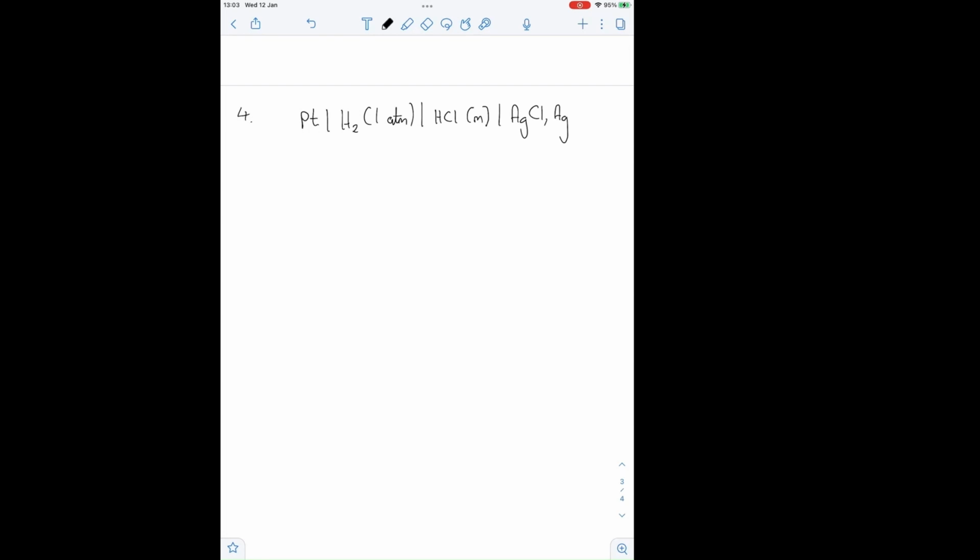This redox couple is under standard conditions. Standard conditions, unit activity. How do I make a solution of unit activity? Okay. It's not the same as the concentration. It's not 1 molar. I want to make a solution of unit activity. I can't really do that. So how do they do a really good measurement to get a really accurate, to within 0.1 millivolt, E0 value?